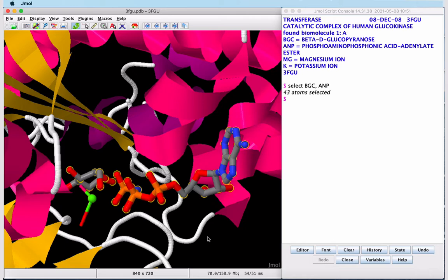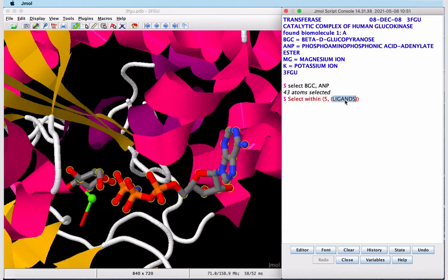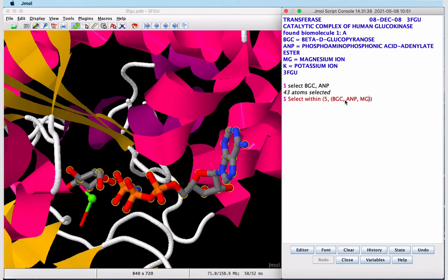JMol is a line command heavy program, so we recommend having a plain text file that's a cheat sheet for commands that you use frequently. In my cheat sheet here, I have a command to select within five angstroms of ligands, and I can modify this to select within five angstroms of the three ligands specific to this structure.